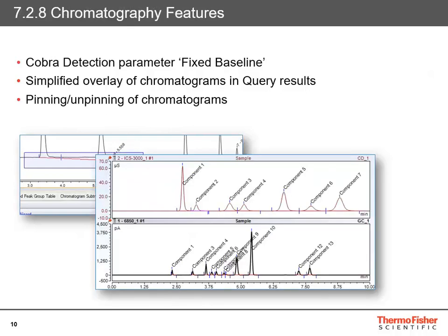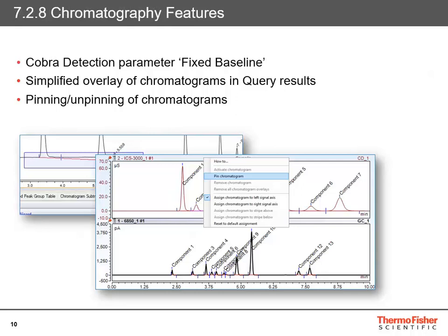There is a new way for pinning and unpinning chromatograms in the Chromatography Studio. The chromatogram plot is now extended to allow pinning of single chromatograms. Previously, you could only pin injections and channels separately — if an injection was pinned and a different channel was selected, the chromatogram would change to the newly selected channel. With version 7.2.8, the chromatogram plot allows you to pin single chromatograms, remembering the combination of injection and channel. Pinning and unpinning is executed via the context menu in the title bar of the chromatogram plot area. Pinned injections are marked with a red pin icon on the left side of the title bar. Selecting a different channel or injection does not remove or change the pinned chromatogram — it remains overlaid until explicitly unpinned.